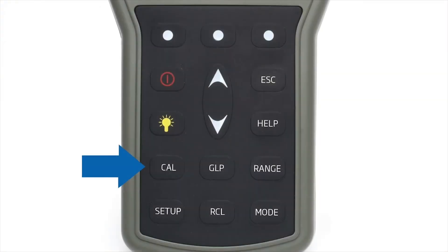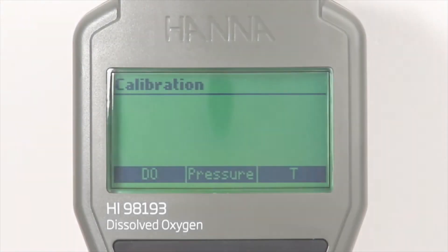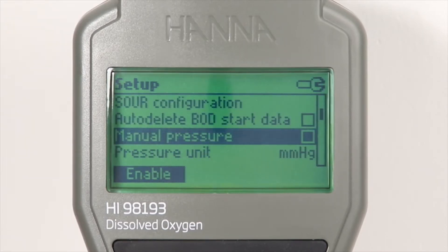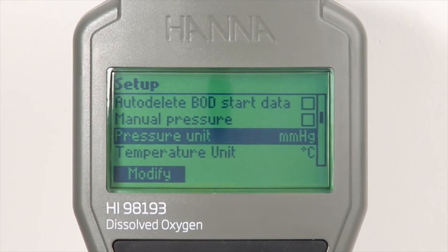Pressing the dedicated cal button allows users to enter automatic calibration. Calibration can be performed for dissolved oxygen up to two points at 0% and 100% saturation. The integrated temperature and pressure sensors may also be calibrated.